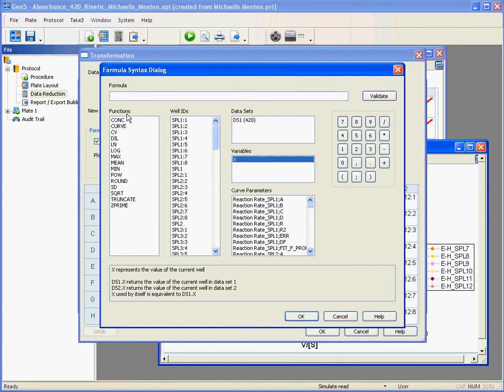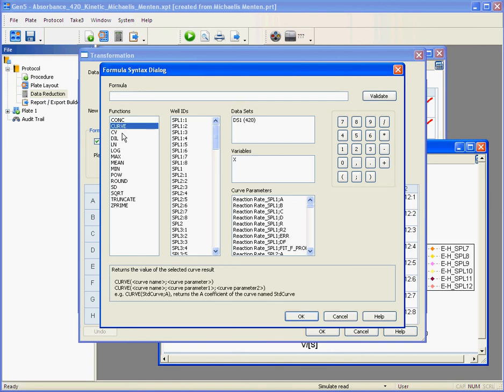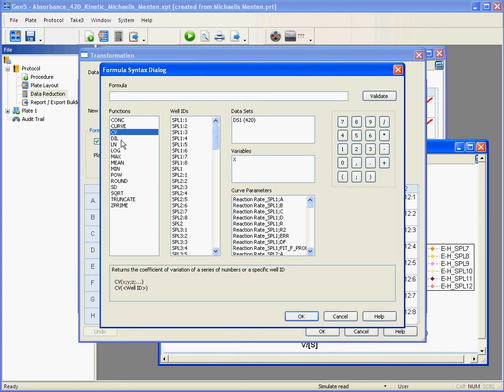And you can use all of those to create a custom formula. What you can see at the bottom part of the dialog here is an area that gives you examples of syntax to facilitate the creation of formulas. You can select any function and you see how it should be used.